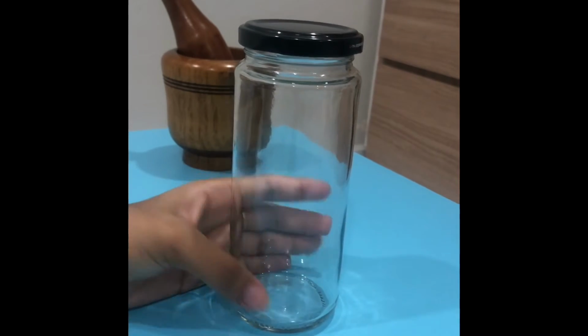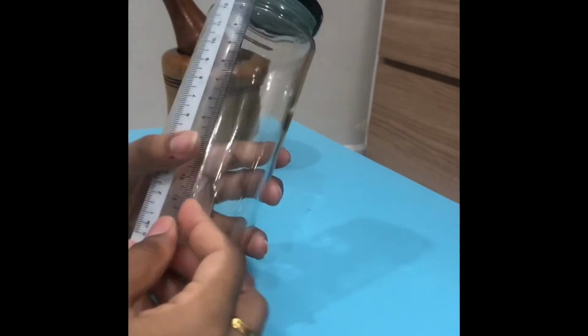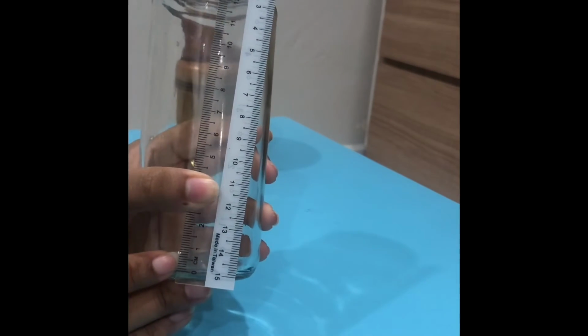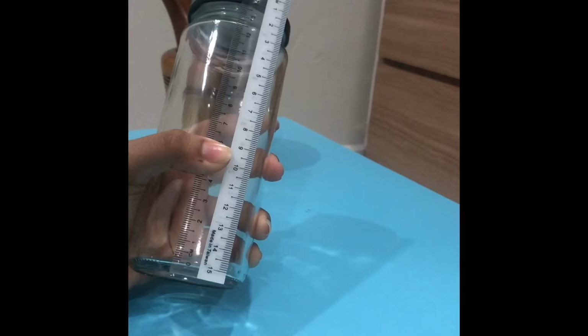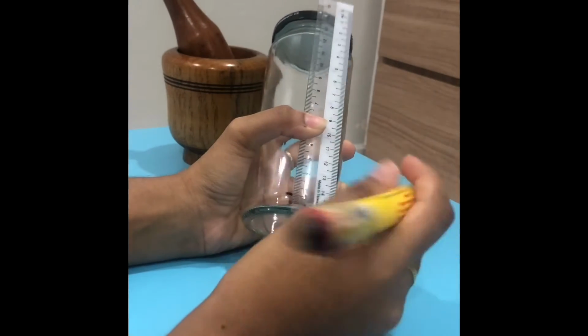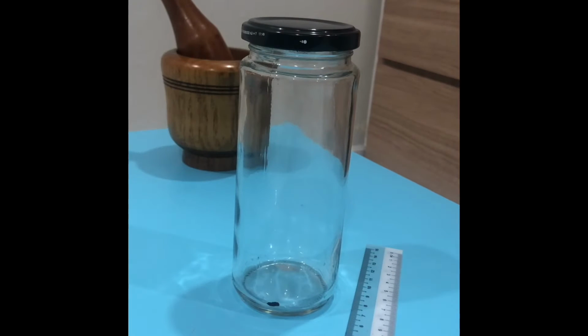So now what I'm going to do is measure 0.5 cm out of this glass chamber, and 0.5 cm is right about here, so I'm going to mark that with a marker pen. Okay, so this is the mark that I'll be making. I'll have to pour 5 to 10 ml of the same solvent, just not exceeding this mark.